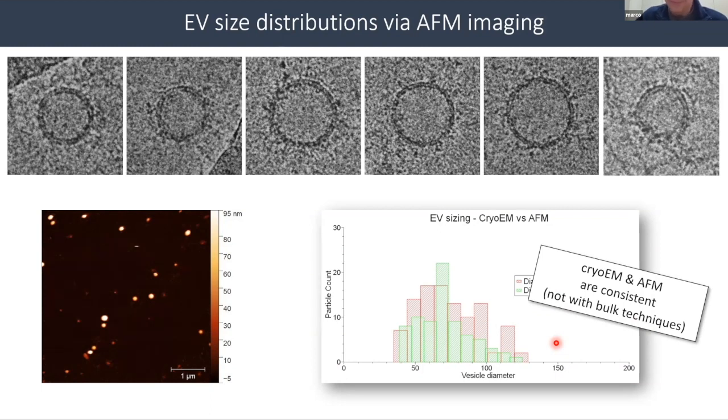Another thing of interest is that invariably you never find vesicles smaller than around 30 nanometers, because from biophysics you can calculate that the strain induced on a bilayer, if you try to force it to close upon itself at diameters lower than 30 nanometers, is so high that it just collapses. So no intact vesicle below 30 nanometers in diameter can exist at room temperature.